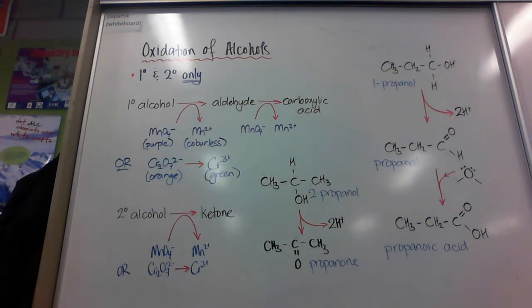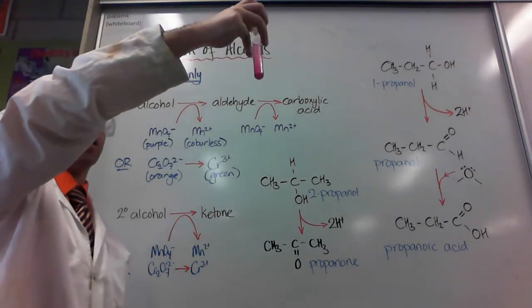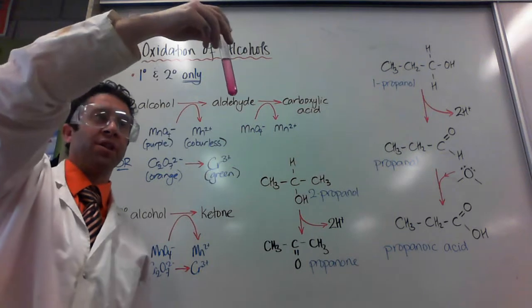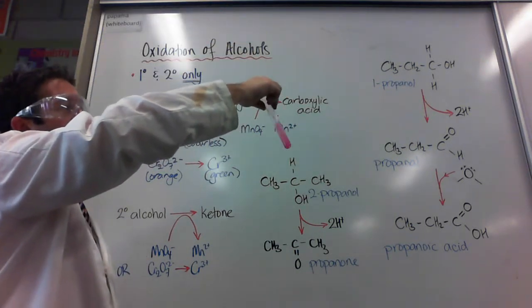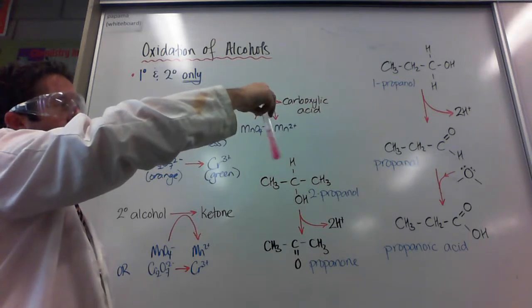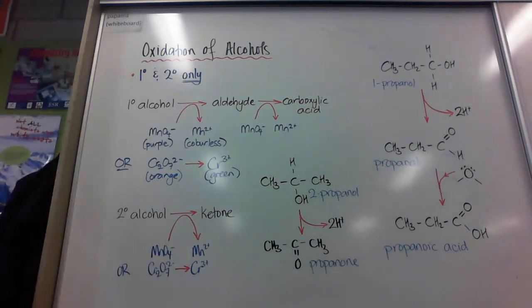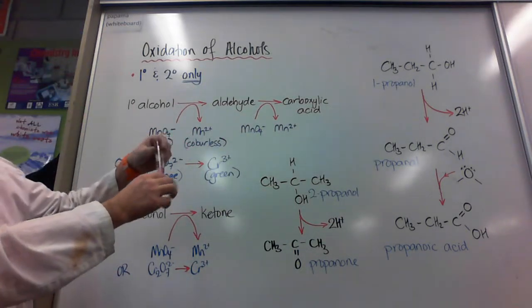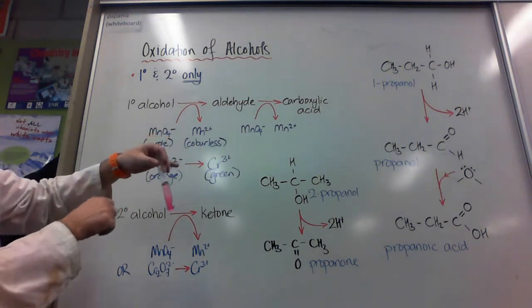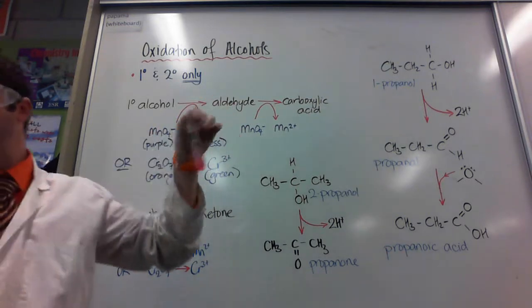So potassium permanganate is a purple or pink solution, and here I have got some ethanol with that, and I've acidified it with sulfuric acid, and you can see that it's starting to take away the purple colour at the top. Ethanol is less dense than the two things we're working with, so its concentration is a bit higher at the top. So the observation we expect to see with an alcohol is that it goes from purple to colourless as the manganese 2 ion is formed. Manganese 2 is technically pale pink, but it's so pale we usually can't see it.